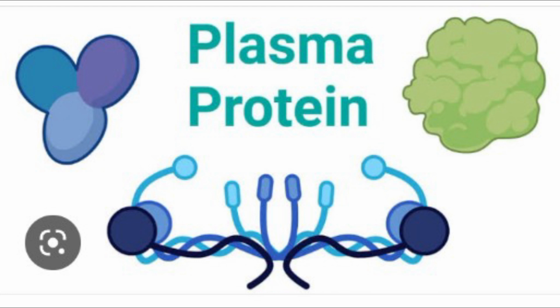Millon test. Tyrosine gives a red color when it reacts with mercuric sulfate and sodium nitrite. Sample 1 ml, add mercuric sulfate, 1 ml concentrated sulfuric acid. Appearance of red color indicates the presence of tyrosine.